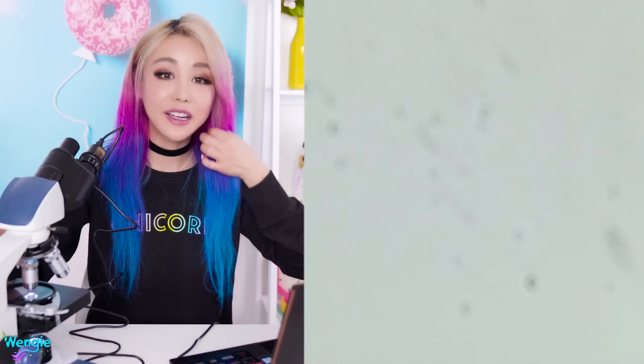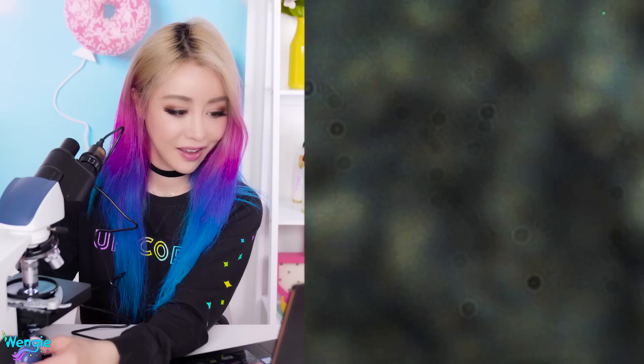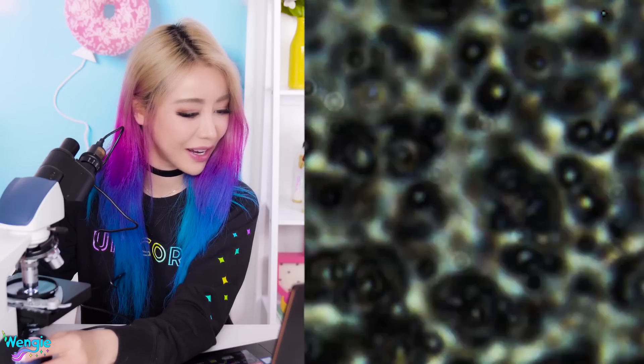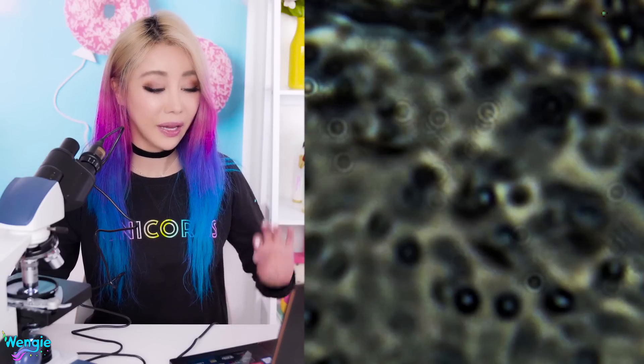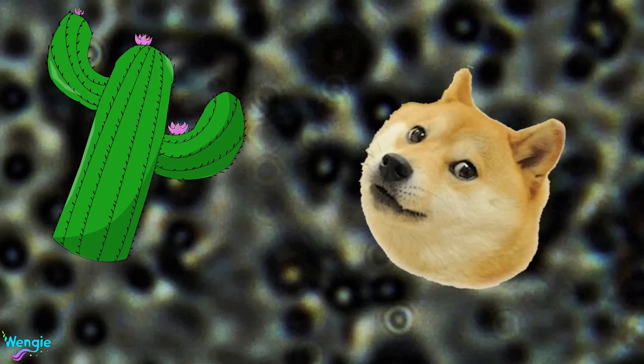We are now down to the real 1,000x zoom. Gross, gross, gross, gross. Look at how many holes there are! I don't even know when it's clear. Sorry guys, I know this whole thing is just me being grossed out, but I have this really bad phobia of holes — trypophobia. Kinda looks like a dog looking at a cactus. I'm trying to make myself feel better here. That was fluffy slime at a proper 1,000x zoom under a real scientific microscope. Let me know down below what you guys think.